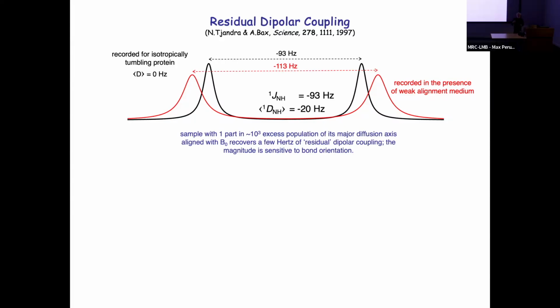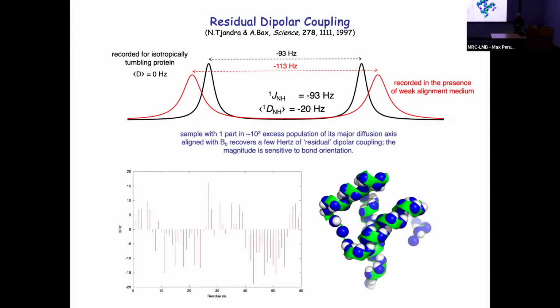That looks really a bit lame unless you see it in practice. So just as an illustration here, we've got a small 3-helix bundle. If you look at the orientation of these NH bonds here, they align roughly coaxial with the helix axis.